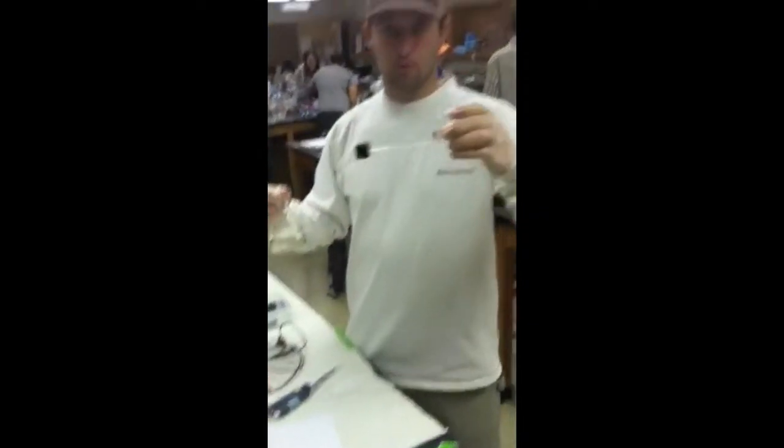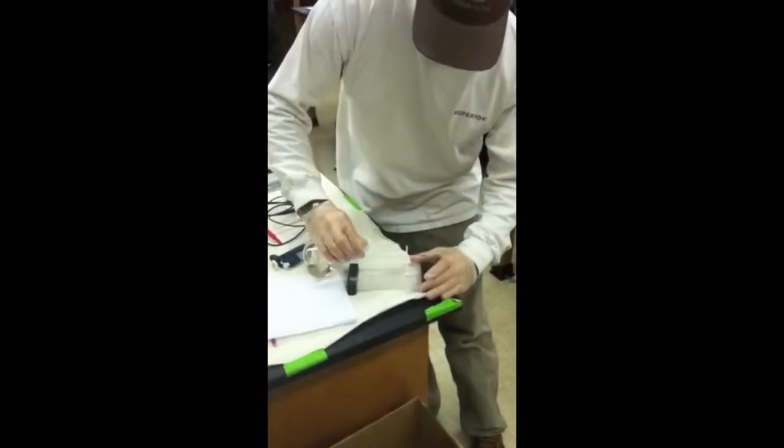And then you're ready to pour it into your tray. Make sure you have your combs with all the teeth already down, and just simply pour.